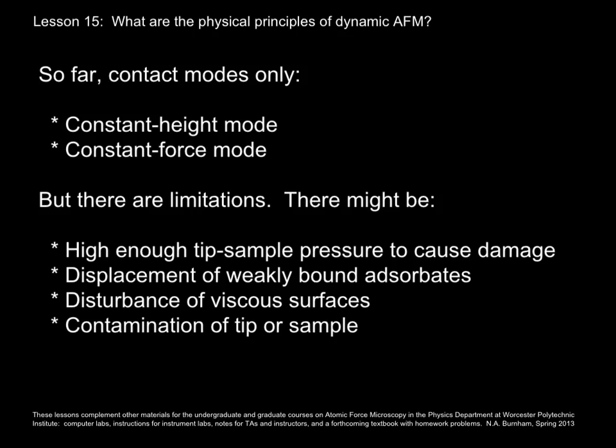So far in this course, we've spoken only of contact modes, a constant height mode when there's no feedback loop, or constant force mode when there is. The reason for that is we wanted to have something simple to talk about just to get you started practicing with an AFM. But there are limitations to contact modes.